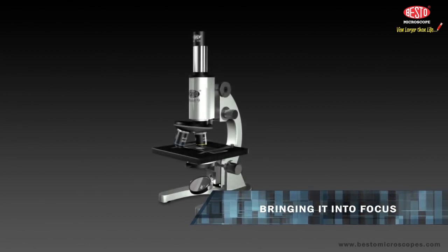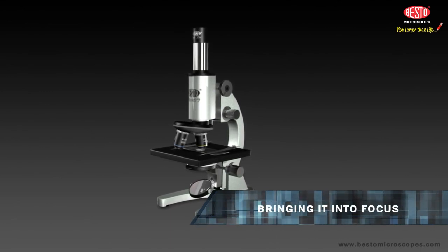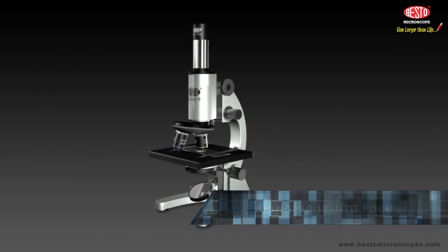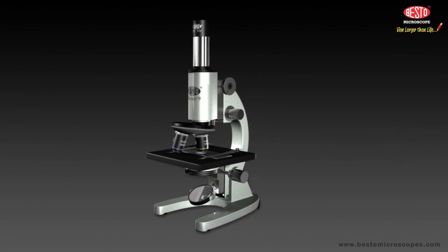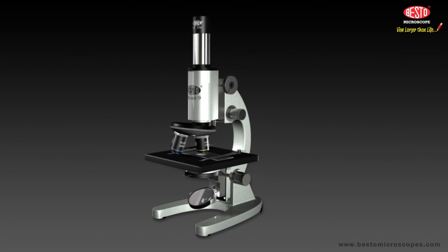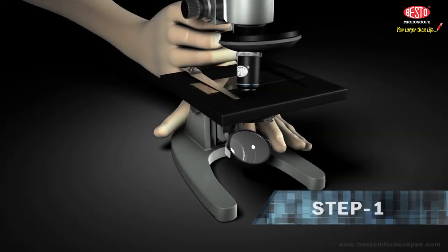bringing it into focus. You're probably anxious to get started using your microscope. Before you use your microscope, you need to know how to set it up properly. This video contains instructions for you to follow. You should come back to here each time you use your microscope until you know the instructions by heart as well as the microscope.